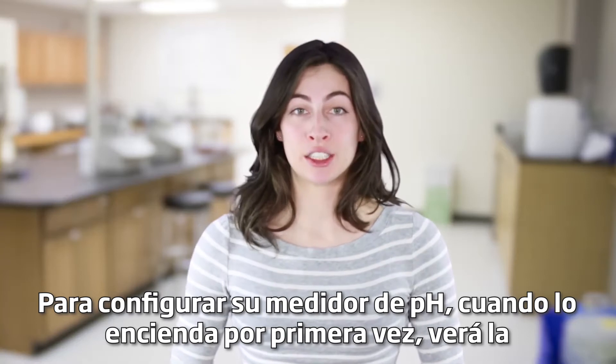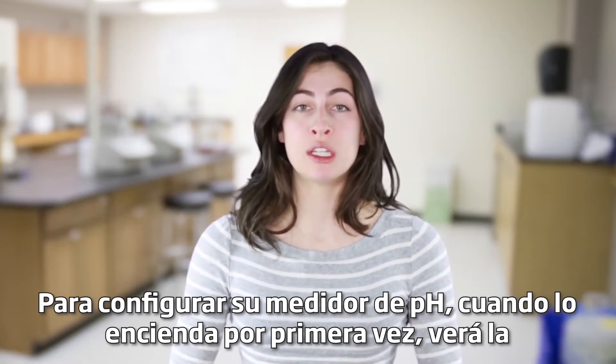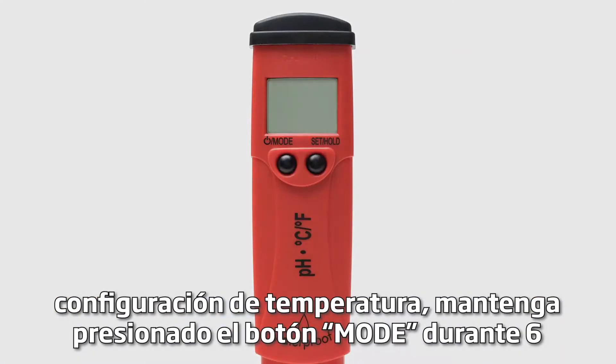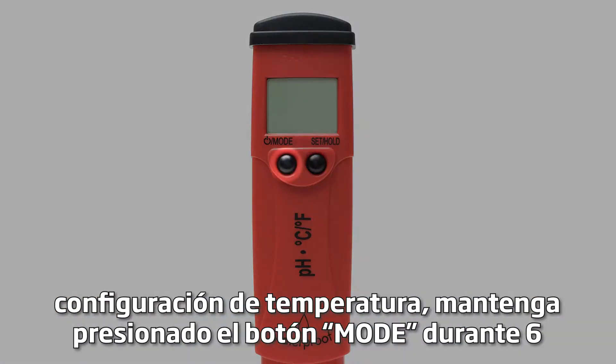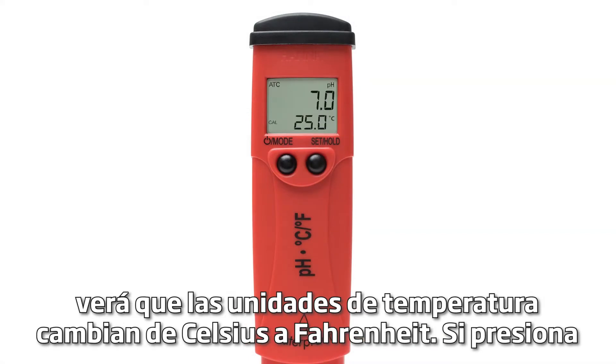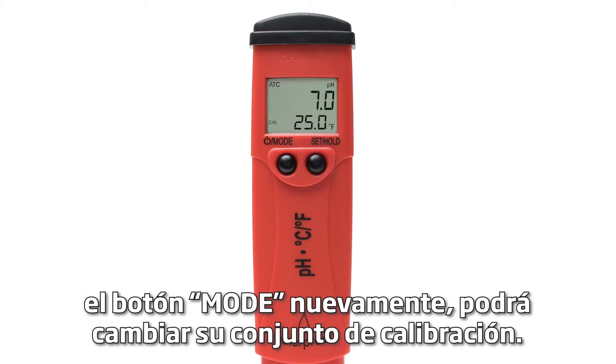To set up your pH tester, when you first turn it on, you'll see the default temperature settings at the bottom of the screen. To change your temperature settings, press and hold the mode button for six seconds until 'temp' shows on your screen. By pressing the set hold button, you'll see the temperature units change from Celsius to Fahrenheit. Pressing the mode button again will allow you to change your calibration set.